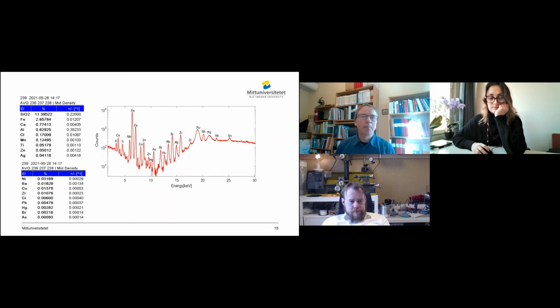This is a more complicated spectrum. This is also paper related, but it's the fiber bank material that we have been looking at and analyzing, and my colleague Faisal has done this imaging using the handheld instrument and some sample preparation on the drying.